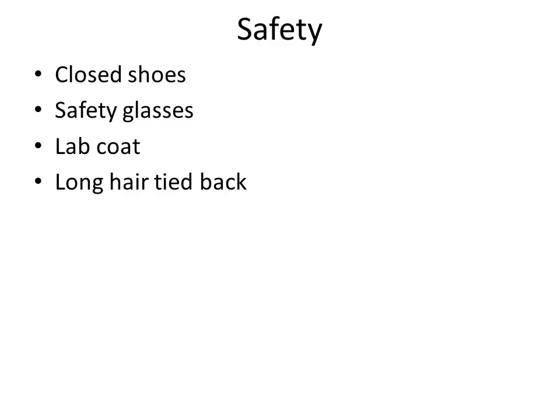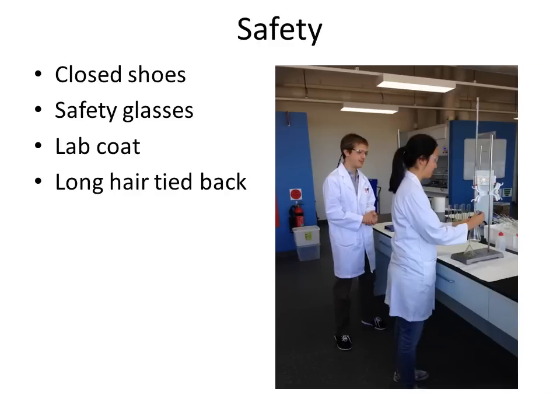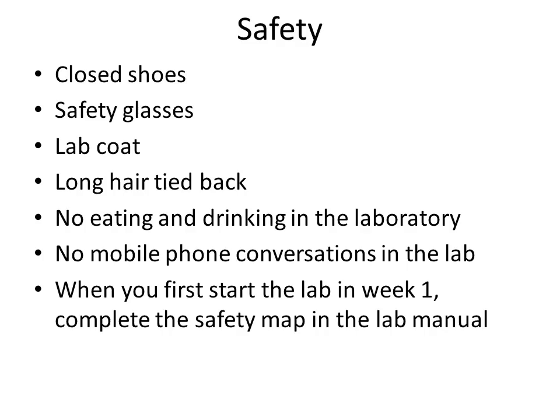You must consider safety at all times when working in the lab. You must wear closed-toe shoes, safety glasses, a lab coat, and have long hair tied back. Whenever you step out of the lab — even if it's just to go to the toilet — take off your lab coat. You're not allowed to wear a lab coat anywhere in the common areas of the building. There is to be no eating or drinking in the laboratory and no mobile phone conversations in the lab; if you must speak on the phone you need to step out. You will find a safety map in your lab manual — when you first come in during week one, complete that map identifying all important safety features. A demonstrator will need to sign off this map before you can start any experiments.